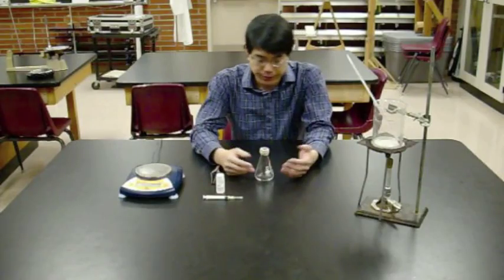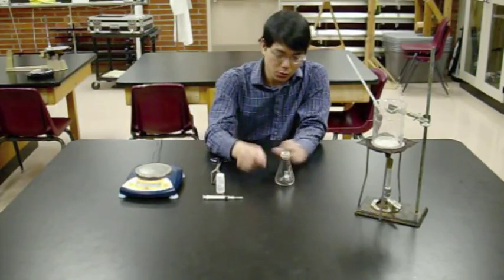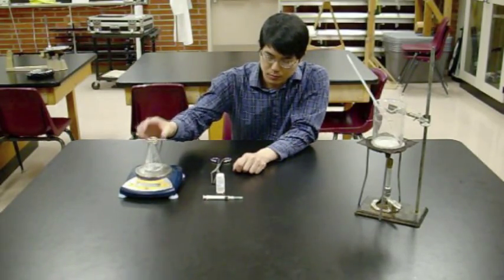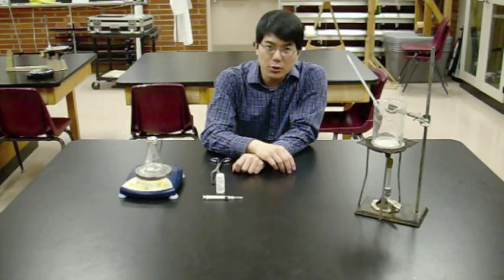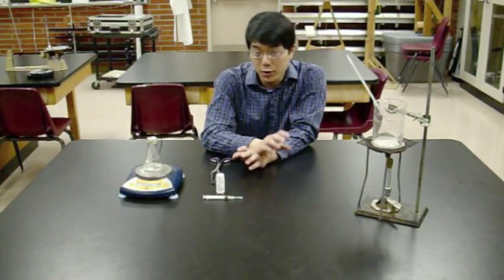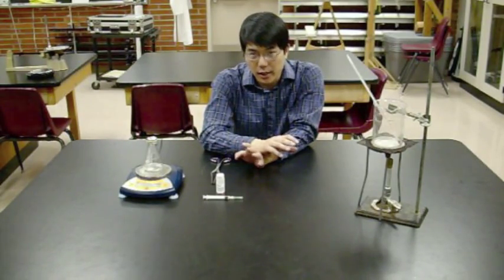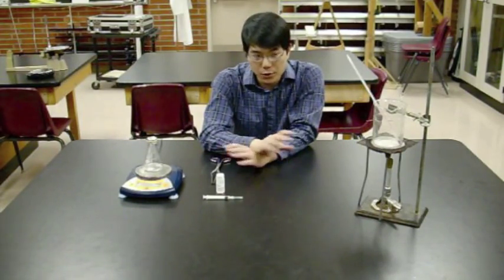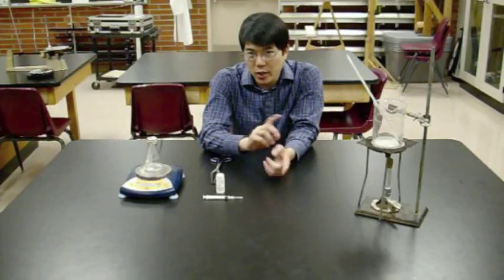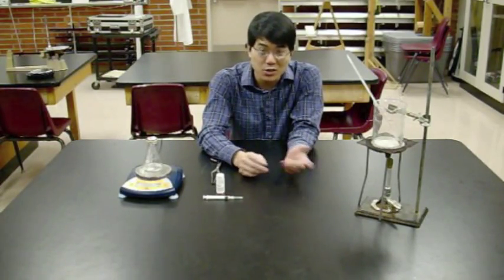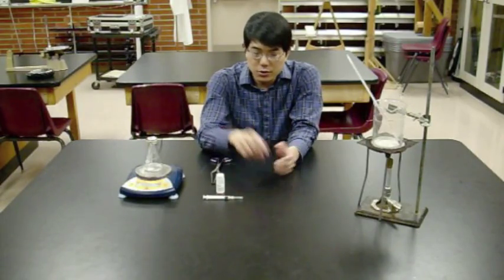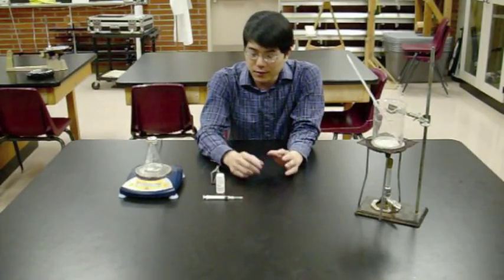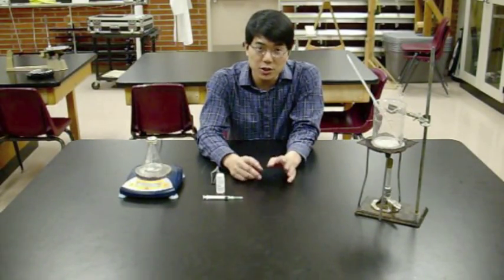Let it cool to room temperature, then take another reading on the same electronic balance so any systematic error cancels out. If you have time—if you're done about 20 to 25 minutes before the end—do this whole process again to get two measurements of the vapor mass. If not, you can do the entire analysis with just one.